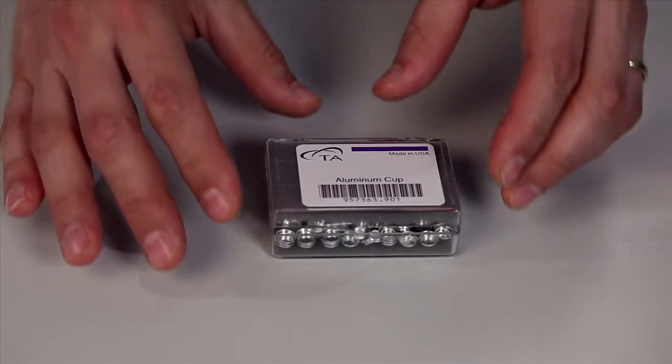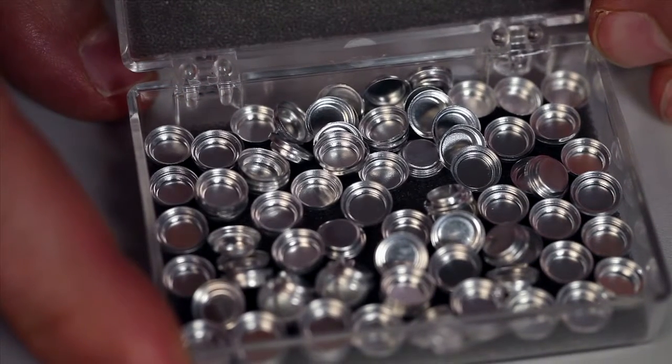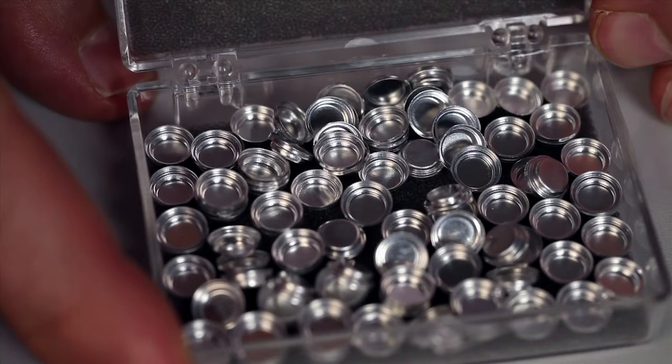Disposable aluminum pens are good up to 600 degrees Celsius for materials for which alumina and platinum pens cannot be used.